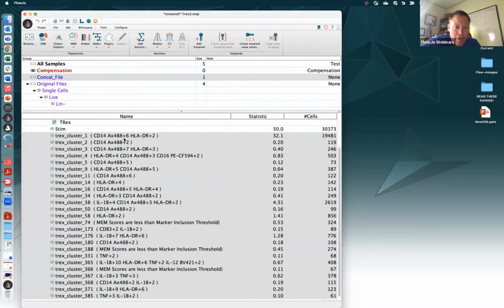All right. So that cluster 1, really high on CD14, high on HLA-DR, not quite as high. And so I like the 1 to 10 gradation. There's a lot of auto naming tools that will give you the plus or minus, positive or negative for a marker, and that's that. I feel like you lose a little bit of information if you simply go plus minus. I like having some gradation here. And so it also gives you an idea like, okay, so all of clusters 1, 2, 3 had more CD14 than the average cluster. So the rest of them down here are going to be a little lower in the CD14 scale, but 3 is a +7 and cluster 1 is a +6. So there's going to be a lot more.